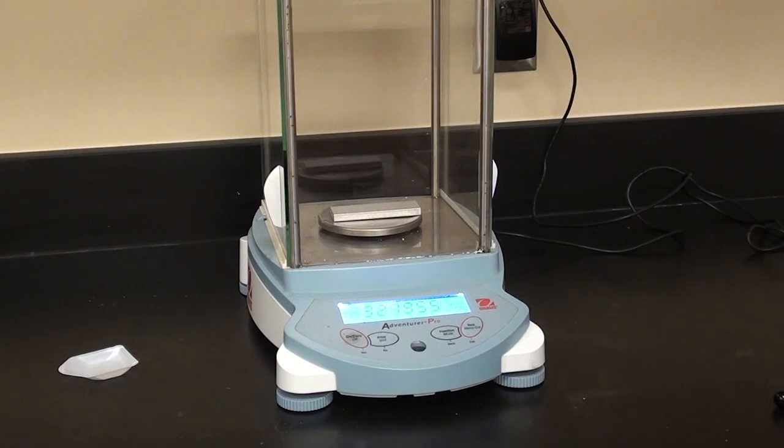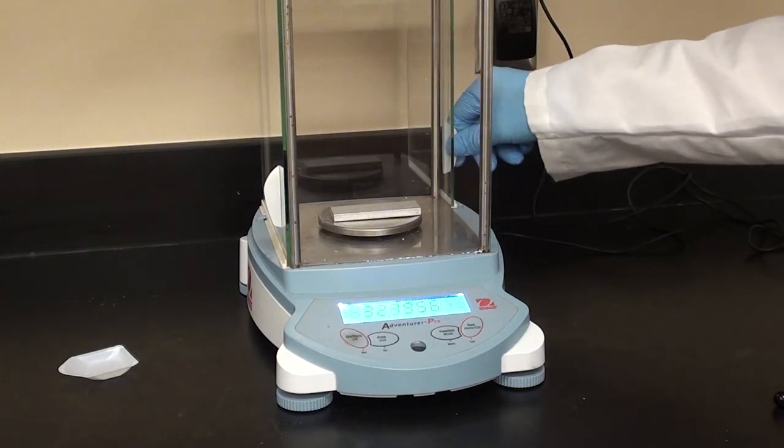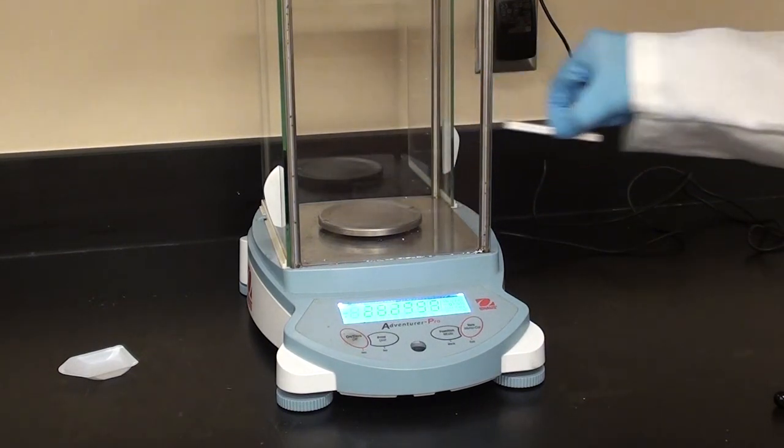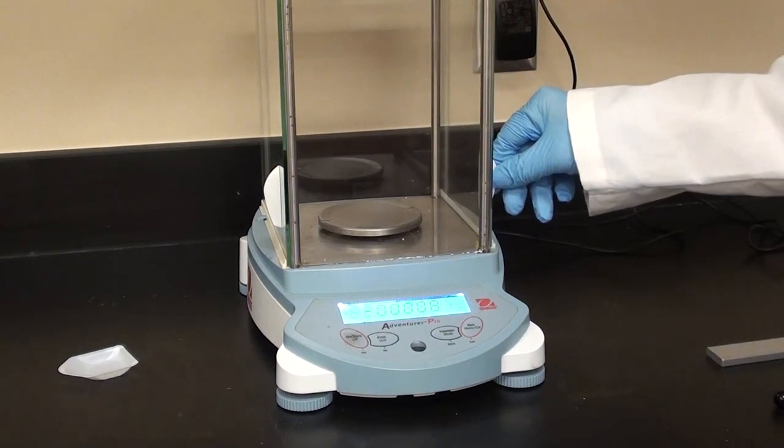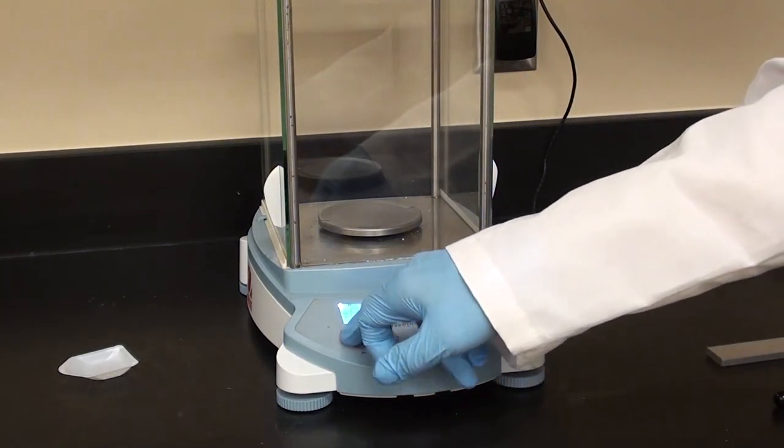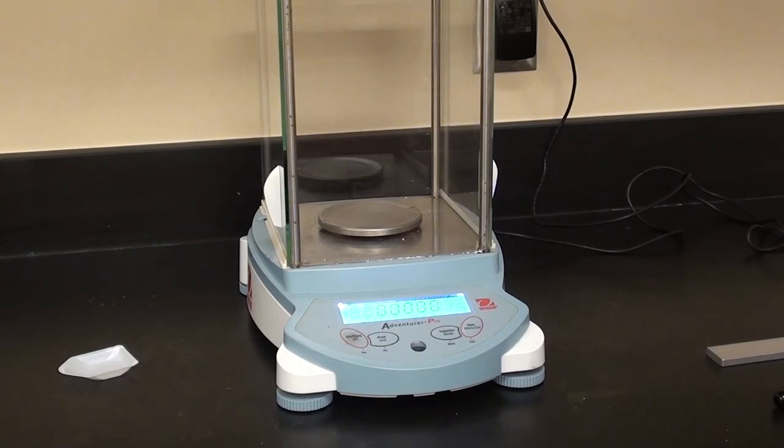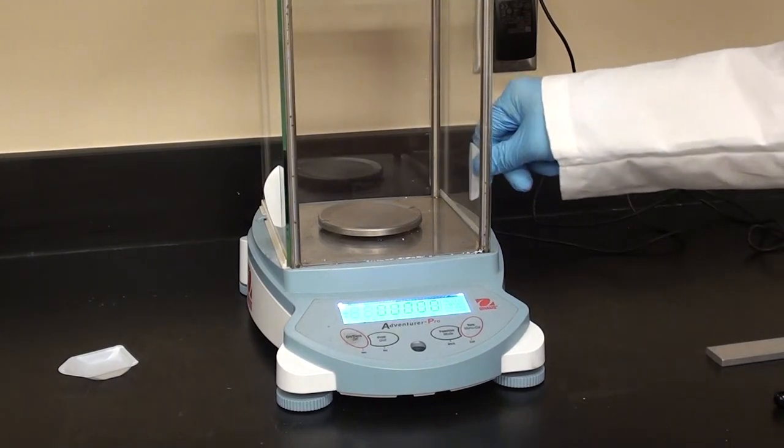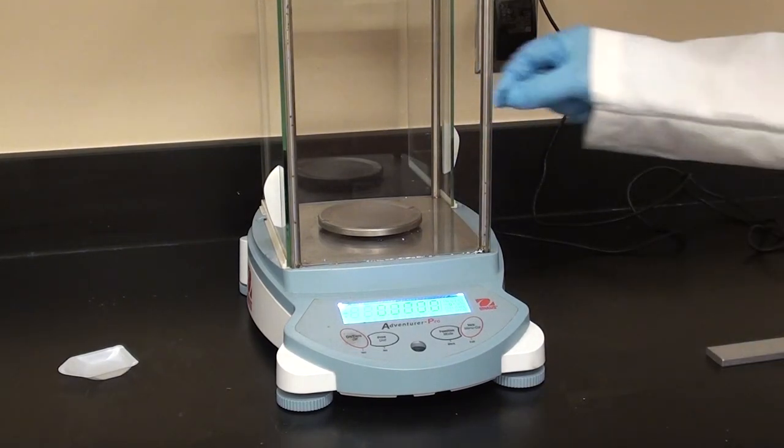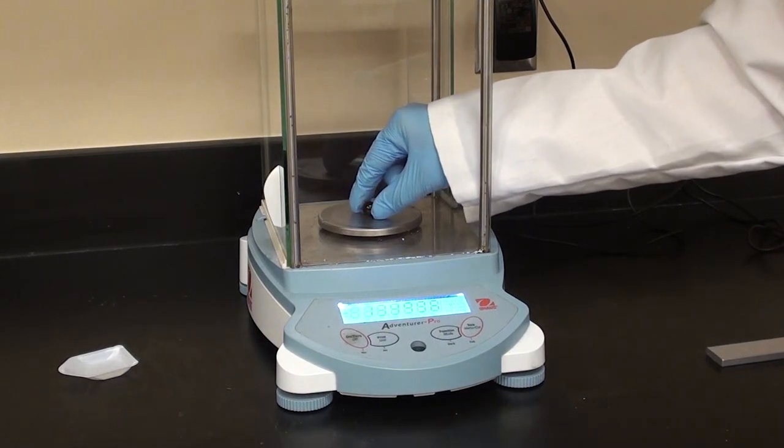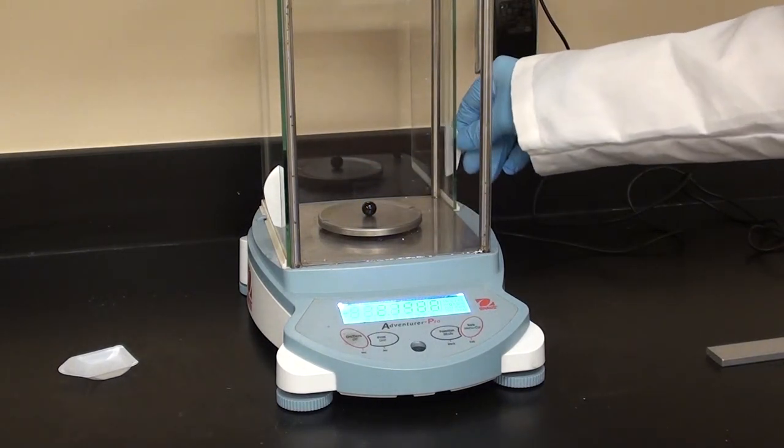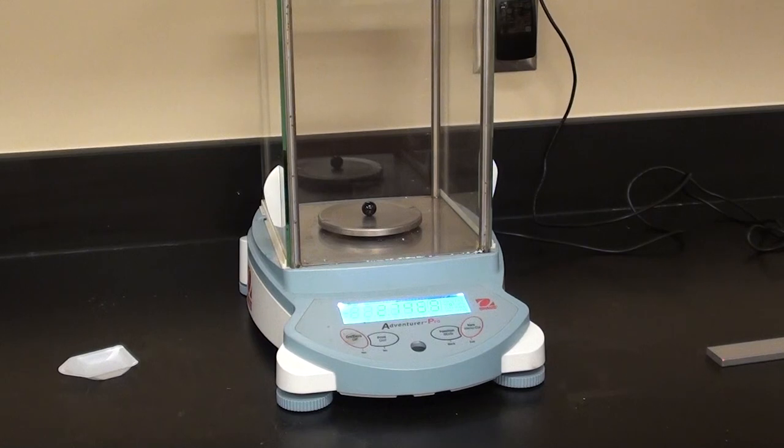Then we're going to take that off. Just to be sure we'll zero it again. Then we'll put the glass sphere on which is going to be basically a marble. And then we'll weigh that as well to all the available decimal places. If you're using an analytical balance like we are then make sure the door is closed for each measurement.